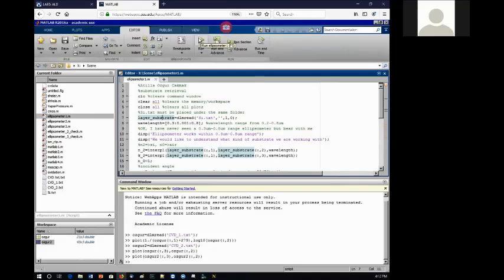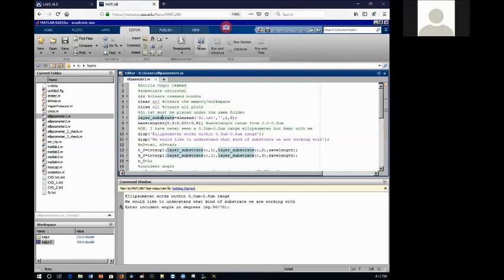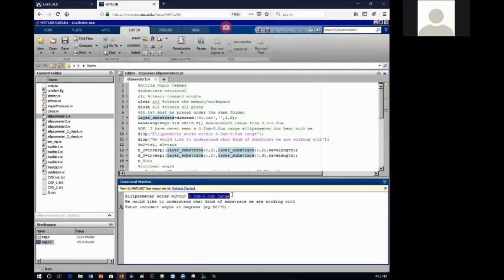It's an optical measurement, and once you hit run here, okay, it's going to ask you, this is the range where we send the light, 0.3 micrometers to 0.8 micrometers. We'd like to understand what kind of substrate we're working with. Enter the incidence angle in degrees. So I'm going to enter 70 degrees. Those are the common incident angles for the ellipsometry.